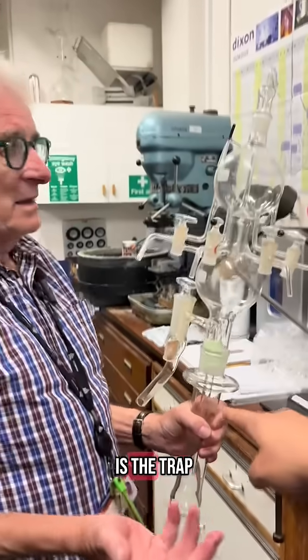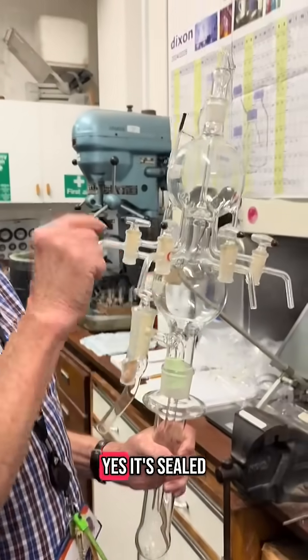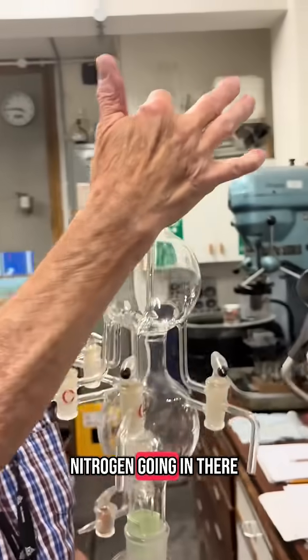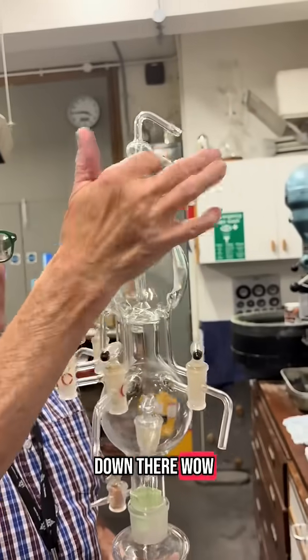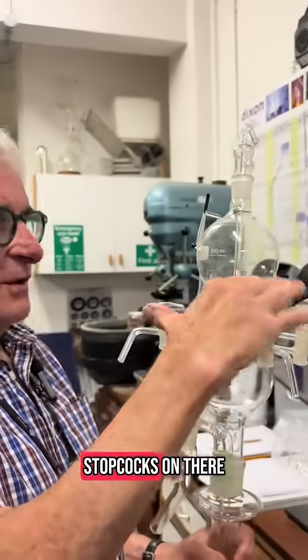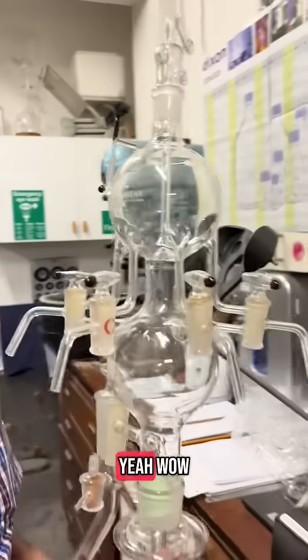This is the trap, and this is the vacuum in here. It's sealed off here, and you've got nitrogen going in there, down there, and out through there. You've got four different stopcocks on there, so you can select vacuum or nitrogen.